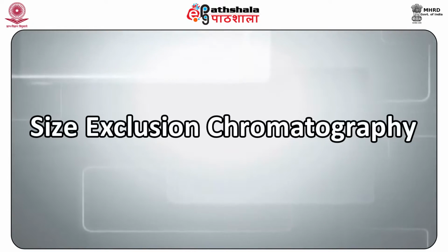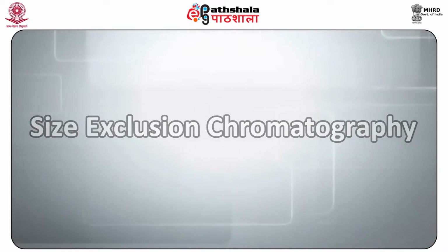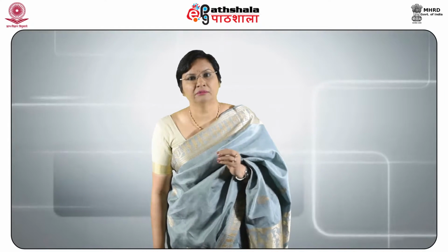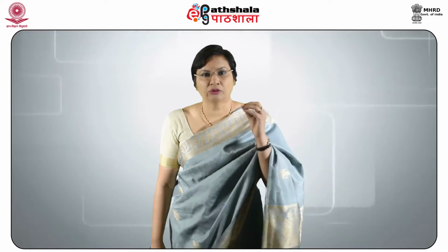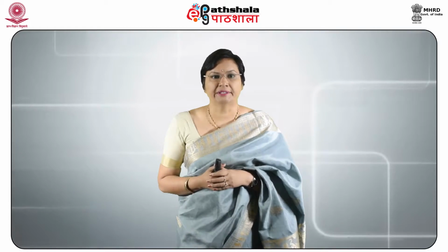Let us now understand what is meant by size exclusion chromatography. Size exclusion chromatography is a method by which molecules can be separated according to their size in solution, and as a consequence, indirectly according to their molecular masses.